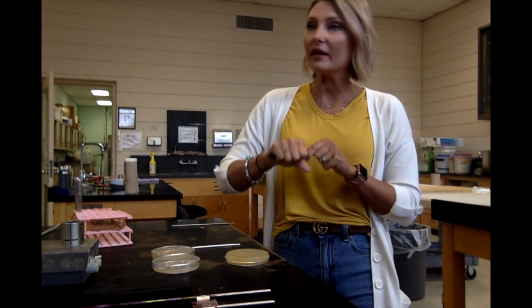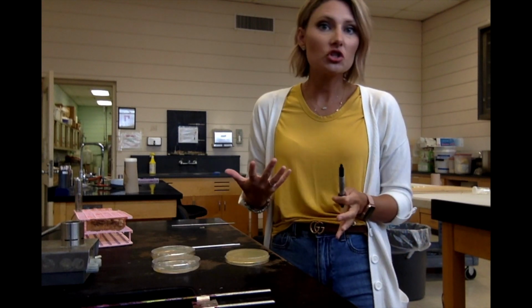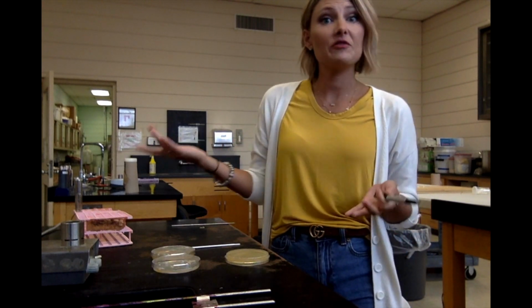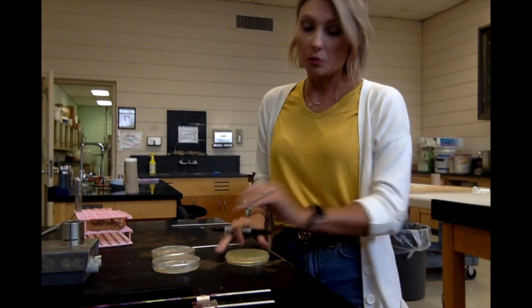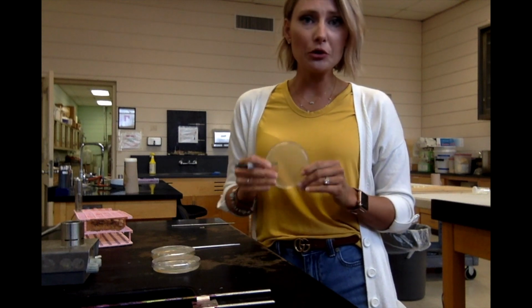Now, it can be anywhere in the lab or out in the hallway, on yourself, on any of your stuff that you have, anywhere that you would like to see if there's any bacteria growing, which there probably is. So the first thing that you want to do is label your Petri dish.